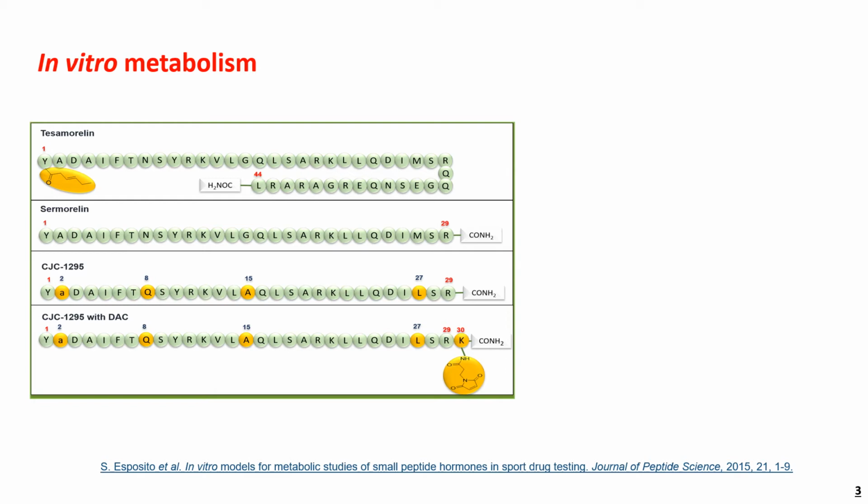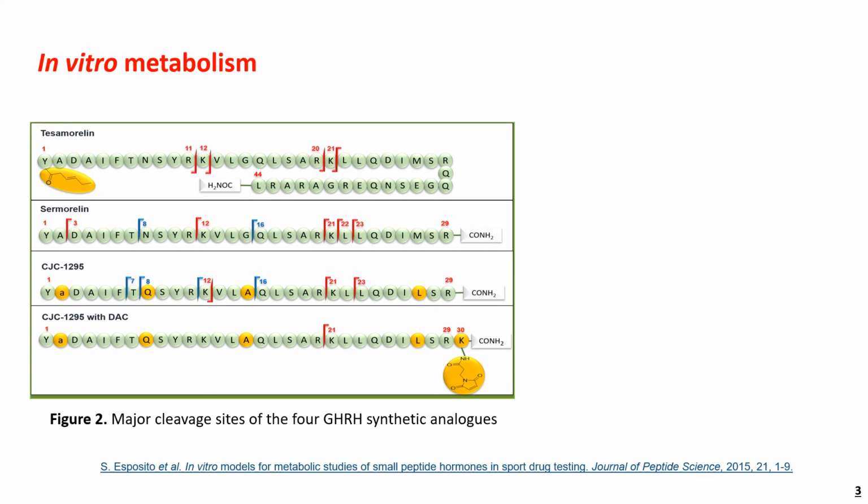After incubation of each peptides with human liver and kidney microsomes and serum, we were able to identify several metabolites via LC-HRMS. Far more metabolites were identified, but we actually selected the most significant metabolites based on the signal abundance in mass spectrometry and on their presence over a long incubation period.